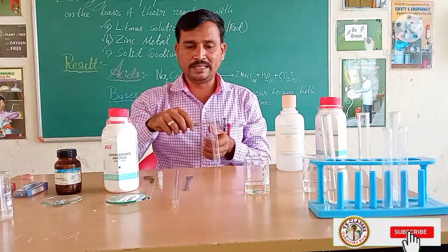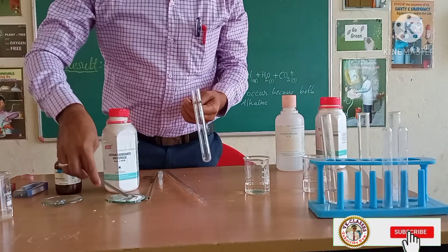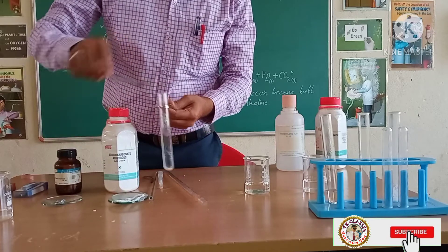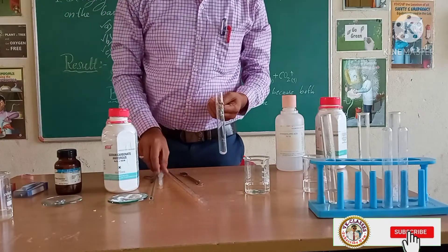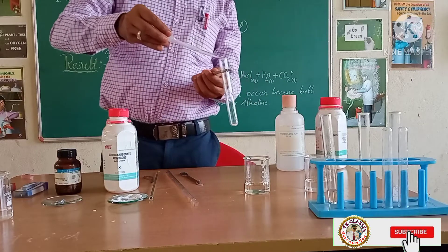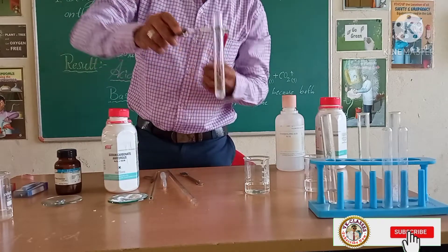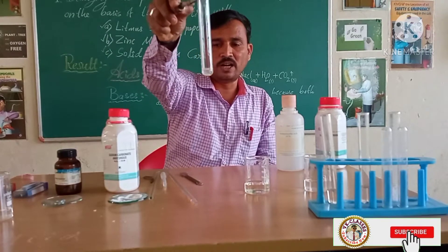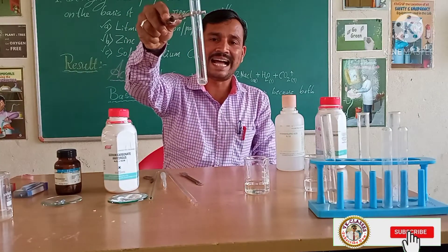Here we will add a little sample of solid sodium carbonate. Again we will add an amount of sodium hydroxide into this test tube.